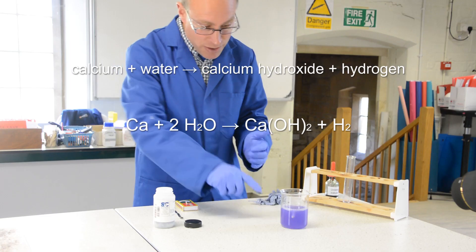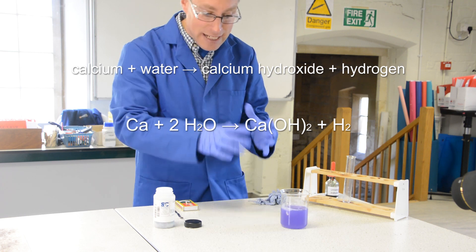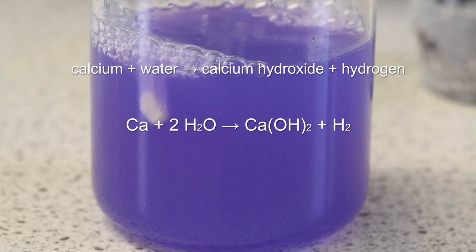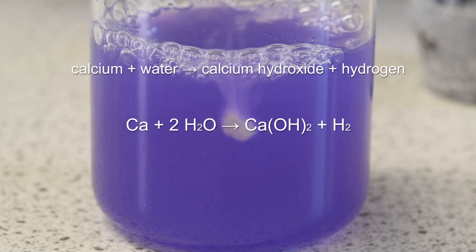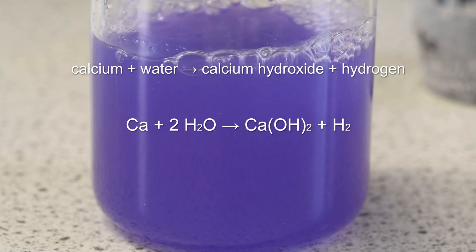Some of that calcium is also starting to float, so it's moving up and down. That's because the calcium gets covered with hydrogen gas and that gas is less dense in the water, so it starts to float up in the beaker.